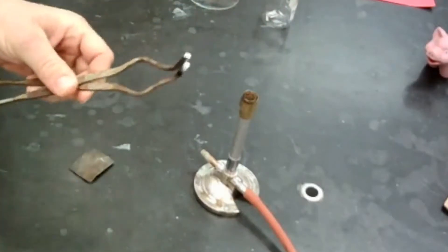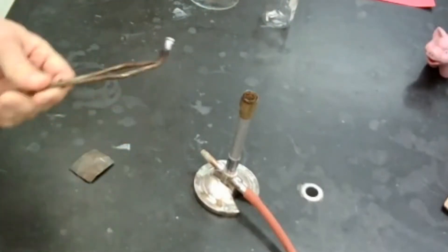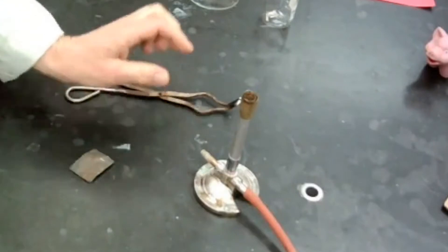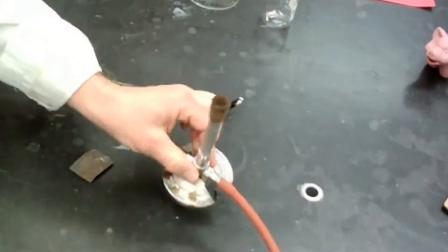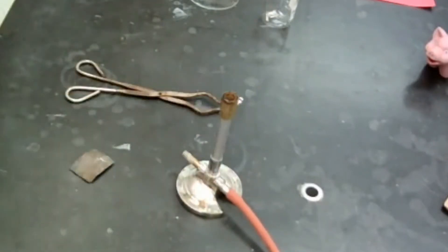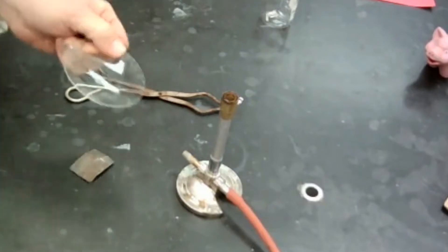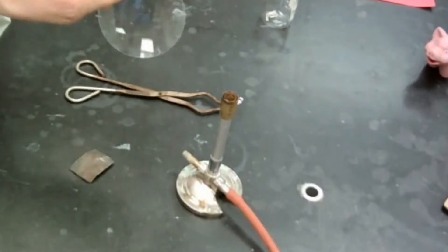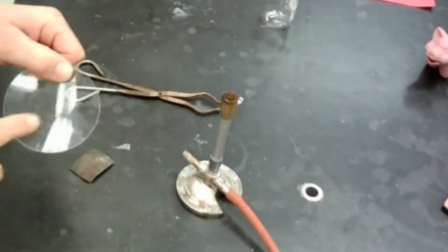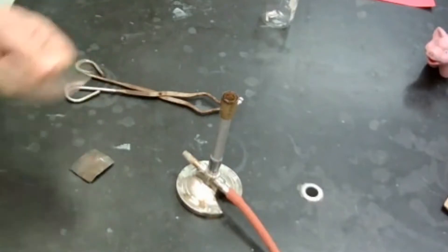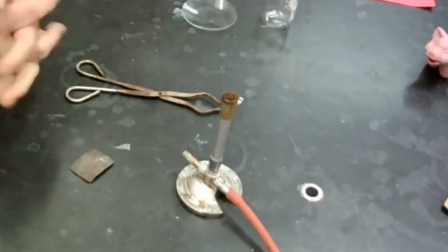We're going to use tongs in order to hold the magnesium ribbon so I don't get third-degree burns. We're going to use the Bunsen burner right here to ignite the magnesium ribbon, and in the end we're going to put the burned magnesium ribbon into this watch glass so that we can identify what the products of this reaction are.